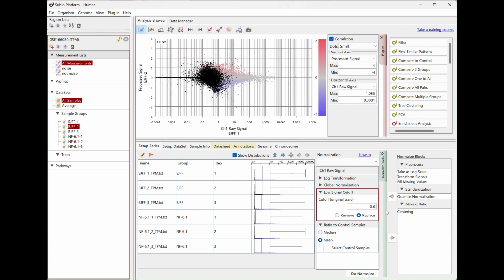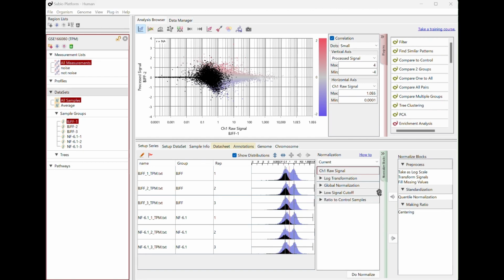Next, let's see what happens if you set the low cutoff at higher than 0.2. You see that giving a higher low cutoff makes fewer noise genes appear. Because the boundary of noise and signal TPM is vague, you have to choose the strategy of accepting noise and retaining more genes for analysis, or giving up many genes to reduce noise.